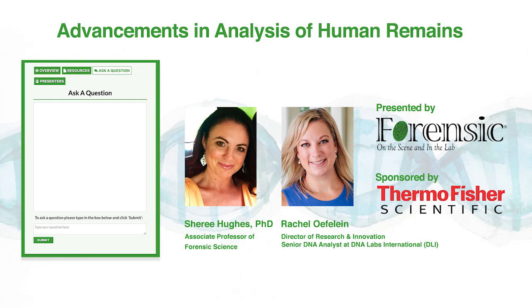Okay. We have a user over here that's wondering what your experience has been, Rachel, with waterlogged bone samples. He's had some trouble using various extraction methods or commercial chemistries over the years. What do you use for waterlogged bone samples? With our waterlogged bone samples, it would depend on how long it's been in the water. We get a lot of small plane crashes and things like that where maybe it's only been in the sea for up to a few days. I find that they actually work great. We're lucky down in South Florida here that we have high saltwater content and things like that. So I find that it actually does really great at preserving the remains.